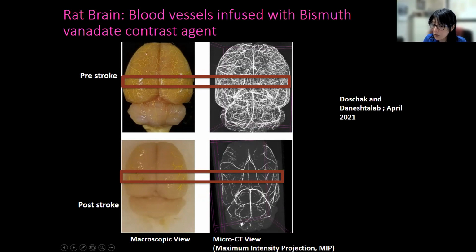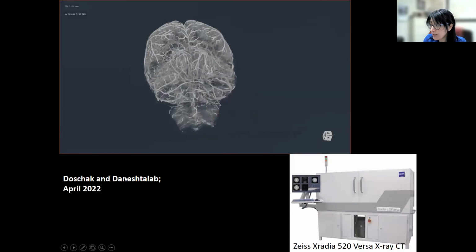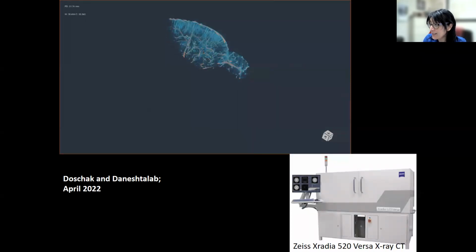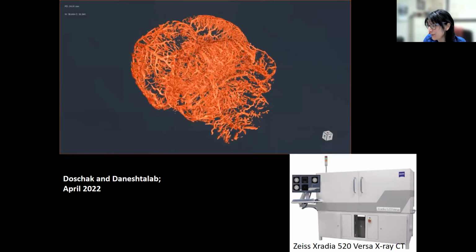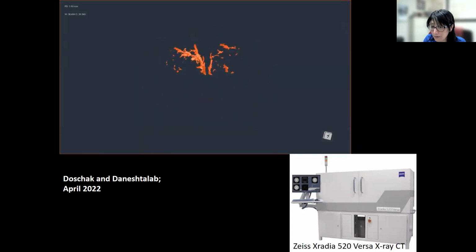What we do is we take a region of interest around the middle cerebral artery area and around the area of stroke, and we try to analyze the level of the connectivity and the vascular intensity as well. What's interesting is that my colleague actually produced this, which is fantastic. This is one of our pre-stroke brains. What we can do is a 3D projection of what the brain looks like after micro-CT imaging. And you can see that these are our vessels, this is our brain on Vascupaint. I'd like to be able to see our vessels on drugs and see what happens with our vessels and imaging with this new modality that we have available to us.